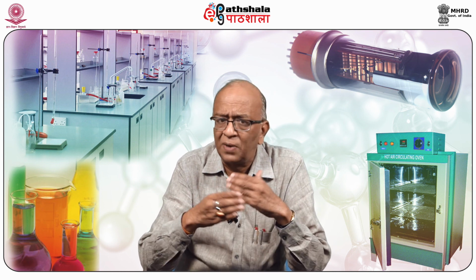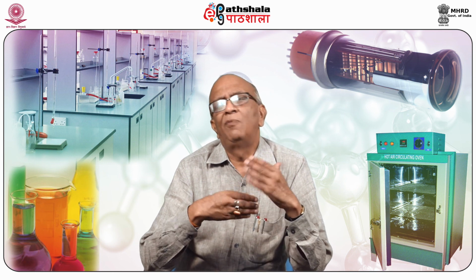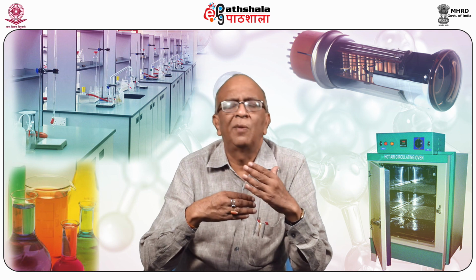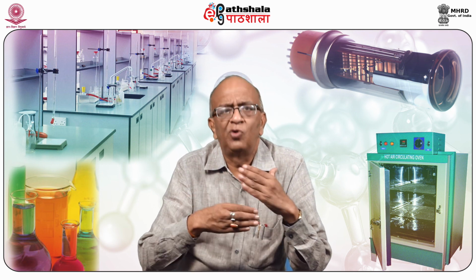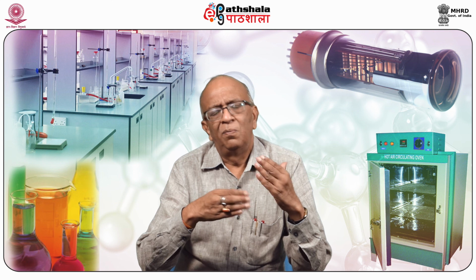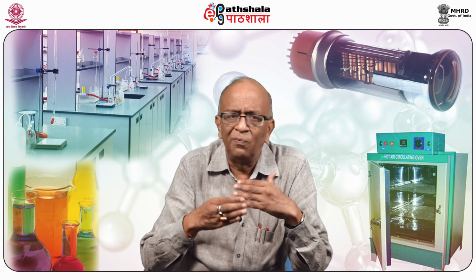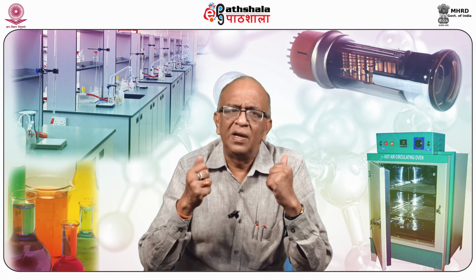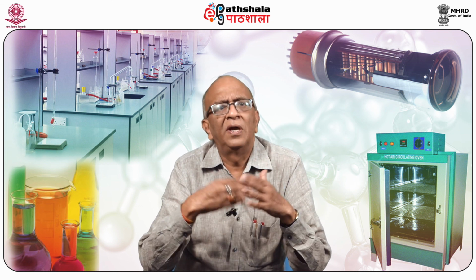But in the case of colorless substances, you have to use some reagent, such as in the separation of amino acids, you have to use ninhydrin. By spraying a solution of ninhydrin and then heating, you may obtain a pink or violet color by which you can identify the substances.